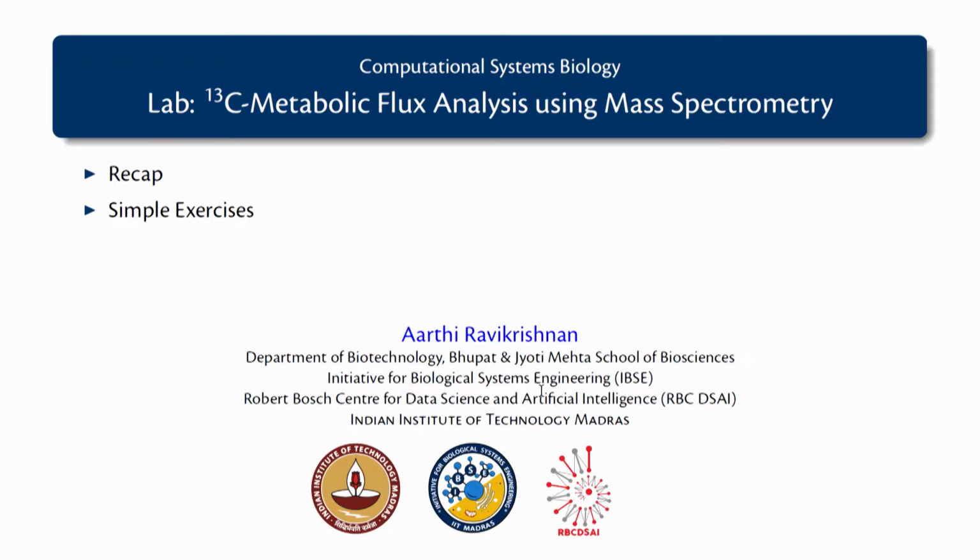In this video we will have a small recap of what has been done previously related to the GCMS data analysis. We will also solve simple exercises which deal with the data from a GCMS chromatogram and a mass spectrum, and see how we can derive useful information from the data that we got.